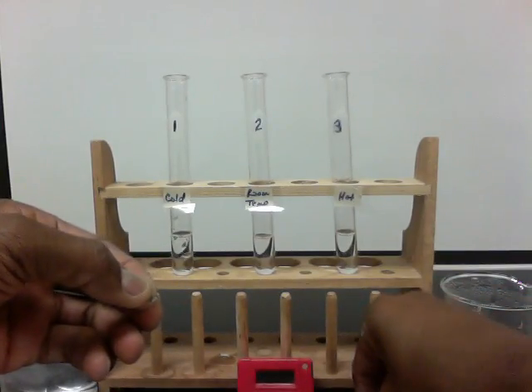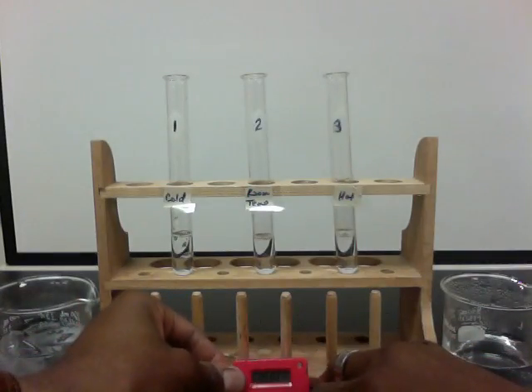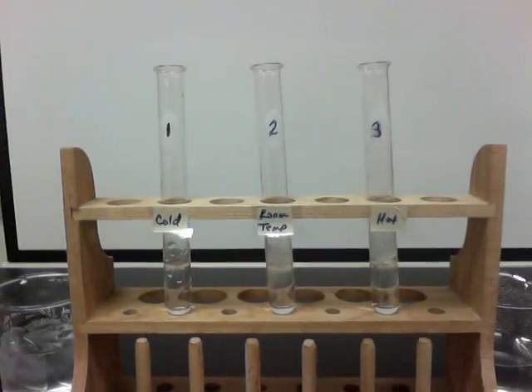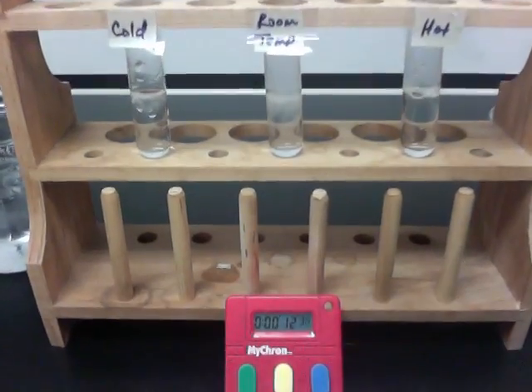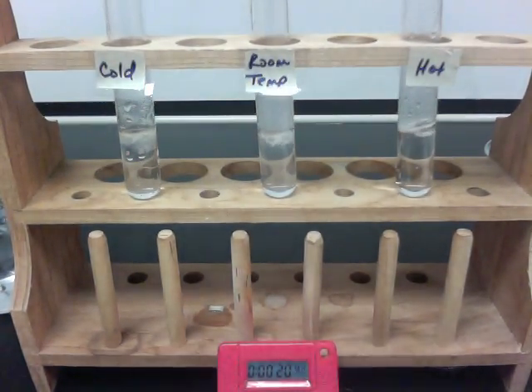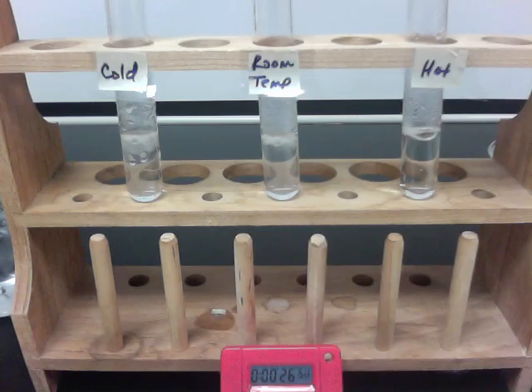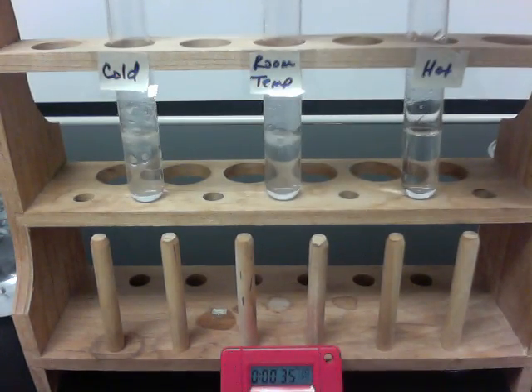If I can grab them here. Okay, put the timer on. As you can see, the reaction has started. So all are reacting. Obviously you can see several things that indicate a chemical reaction is taking place in each test tube. And it looks like the hot is done.